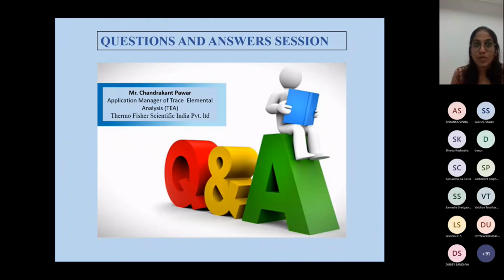Okay, thank you, sir. The another interesting question is by Dr. Akhil Mohan. He's asking that if elements are present in ppm, how can we analyze them in ppm using the CHNS instrument?